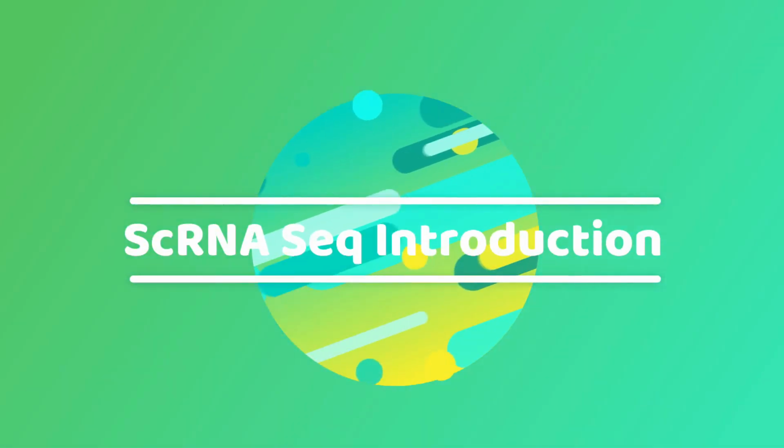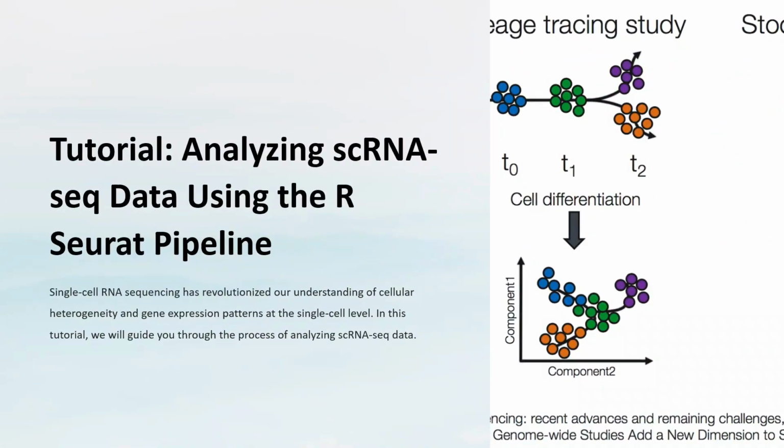So, single cell sequencing data analysis. If you are learning bioinformatics or you want to learn bioinformatics, you should know that single cell sequencing has revolutionized our understanding of cellular heterogeneity and gene expression patterns at a single cell level. Seurat is a widely used R package that provides a comprehensive pipeline for analyzing single cell sequencing data.